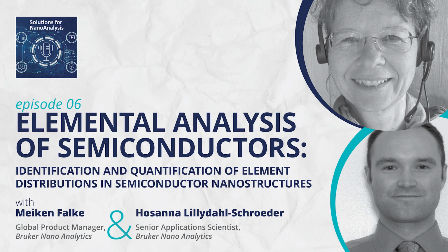So there is a side to this which is complex for an EDS manufacturer, but also very interesting, because if we wanted to have many detectors looking at the specimen, it's the easiest to implement them into the microscope. So for the customer, the best solution to be fast is having the detectors integrated in the column, or having the column or the EDS ports being adapted to what EDS needs.